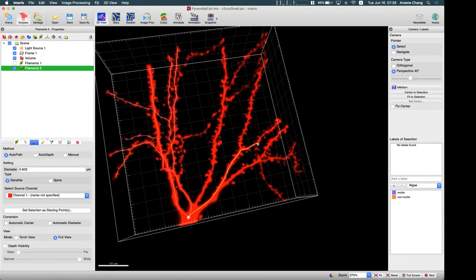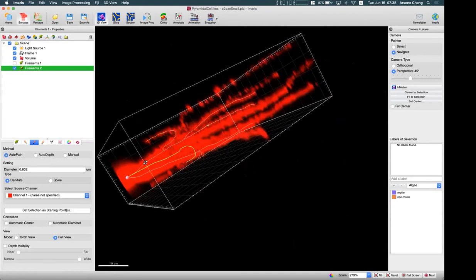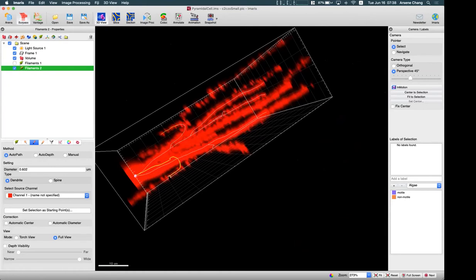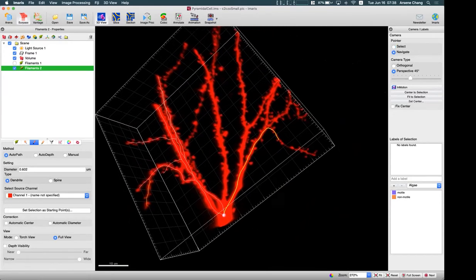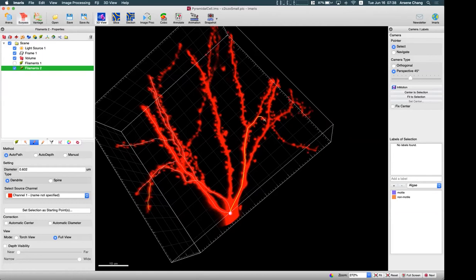There are some useful shortcuts to help with tracing. When Imaris compares intensity between the mouse pointer and the starting point, it finds the best route — but as you move the mouse pointer further, it can start making the wrong route. To correct this error, you can first finish the tracing and then redo the branch from the correct starting point.